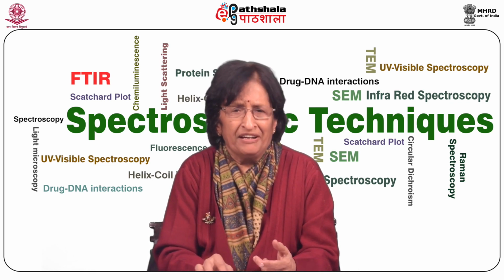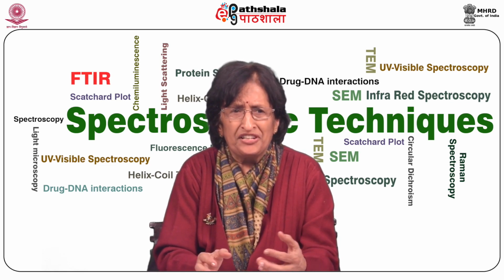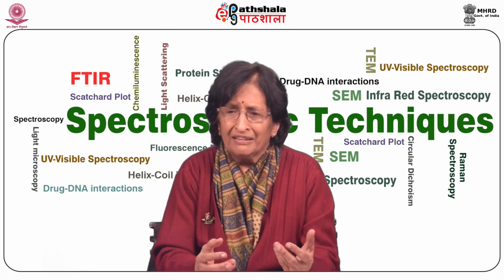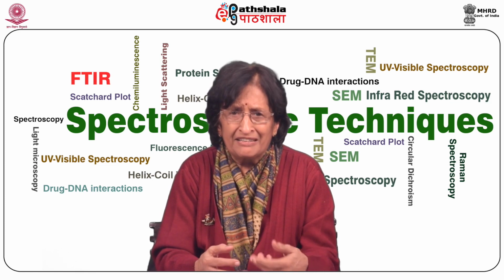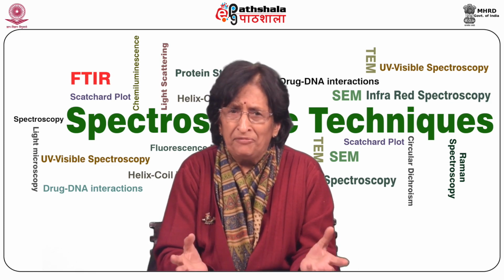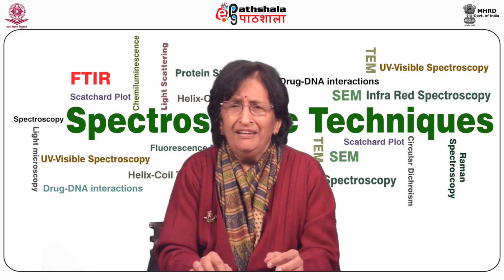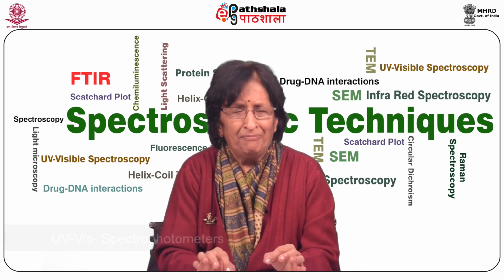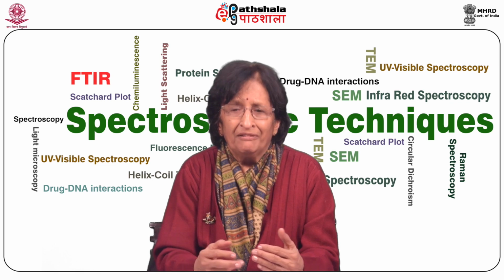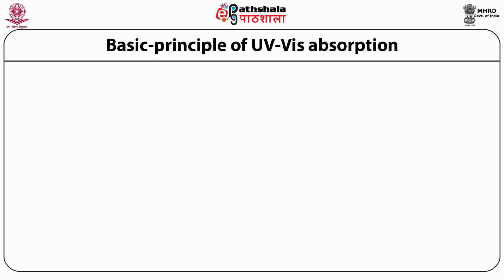It has many applications. Because of its applications in the field of medical, biochemical, biophysical, structural, industrial, and various fields, every experimental laboratory is always equipped with some UV-Vis spectrophotometer. They might change depending on the desired output, but you always have one UV-Vis spectrophotometer. Basic principle of UV-Vis absorption.